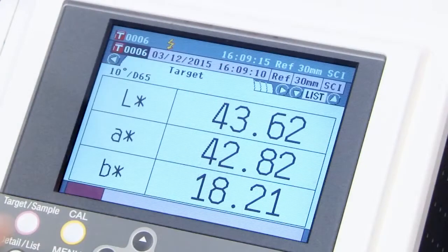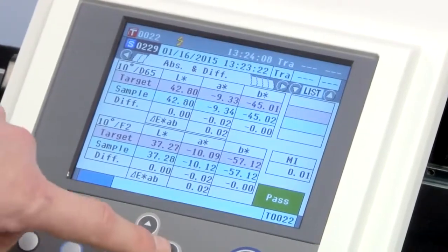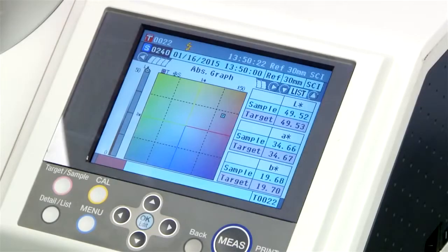Scroll through a variety of results including LAB color difference, 3D color space, and spectral curve.